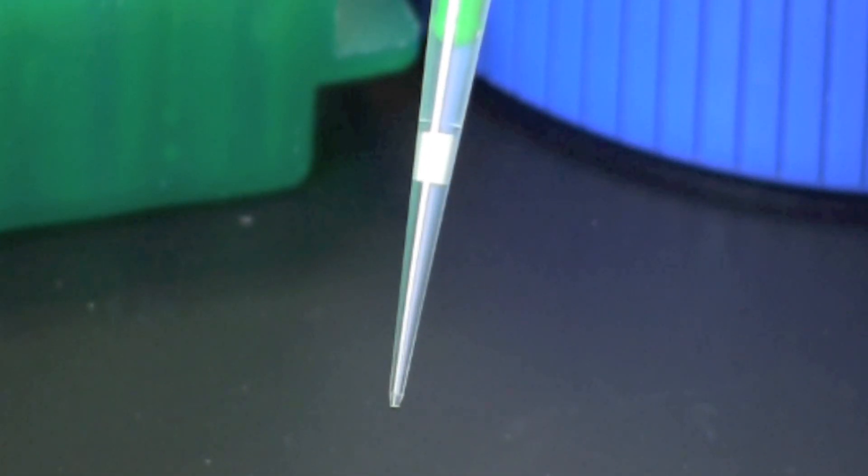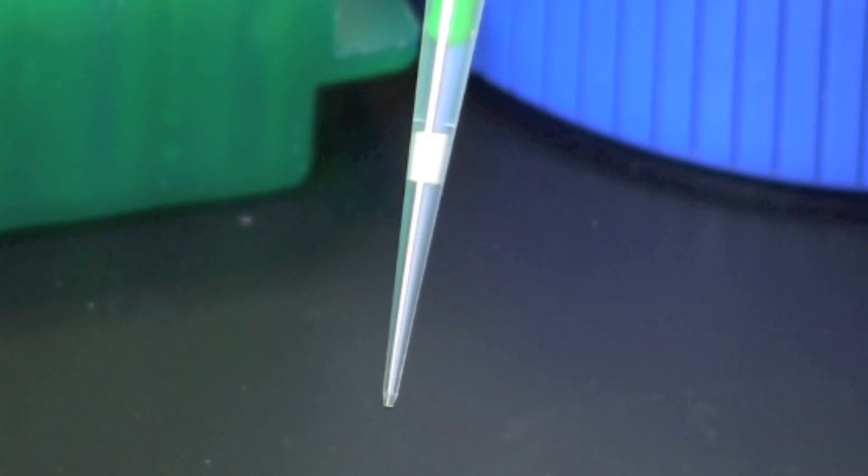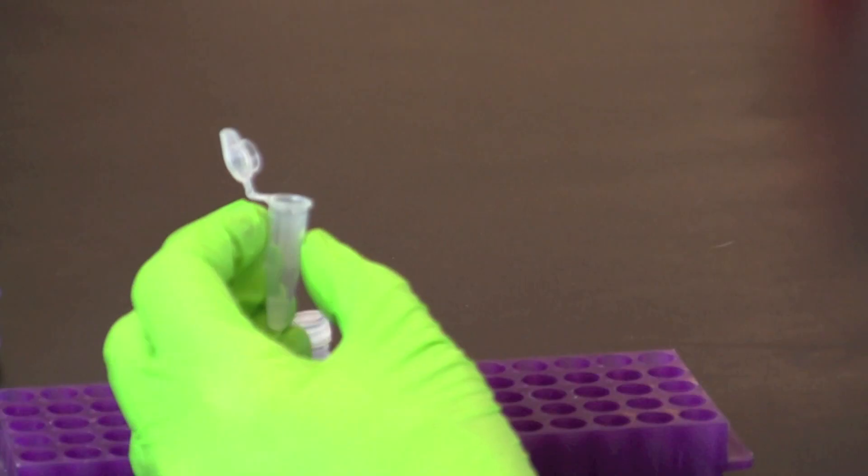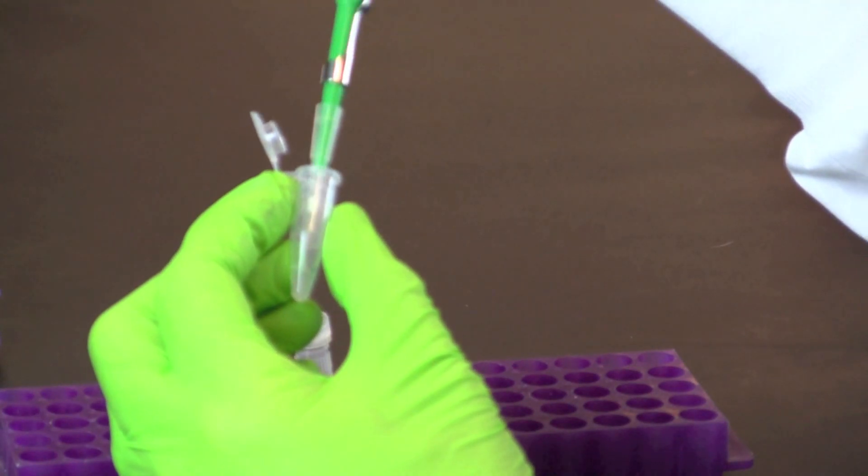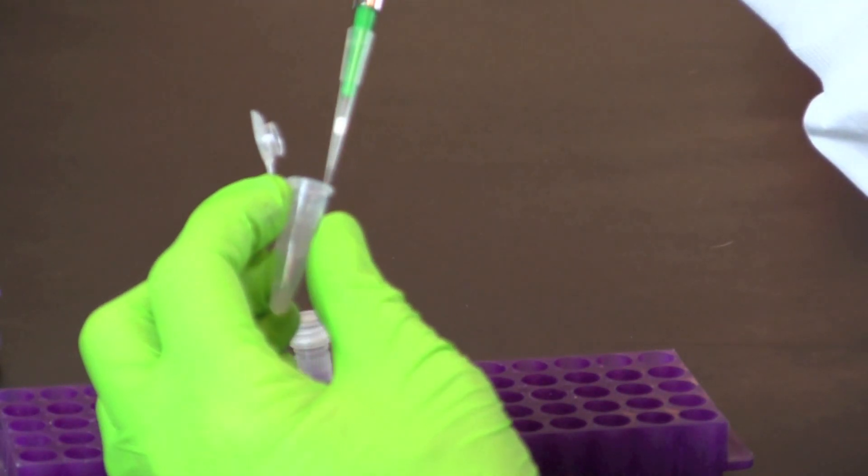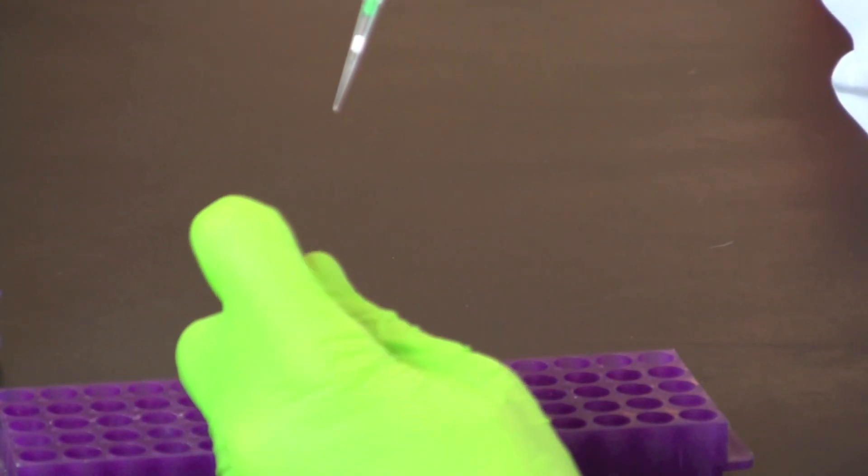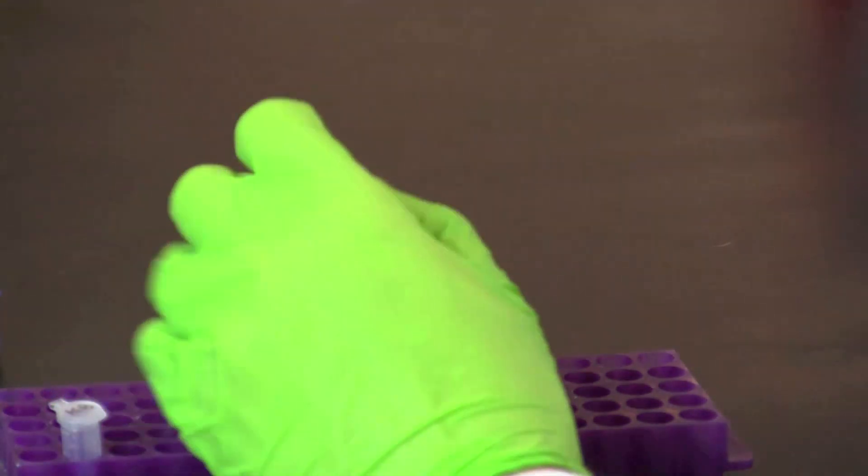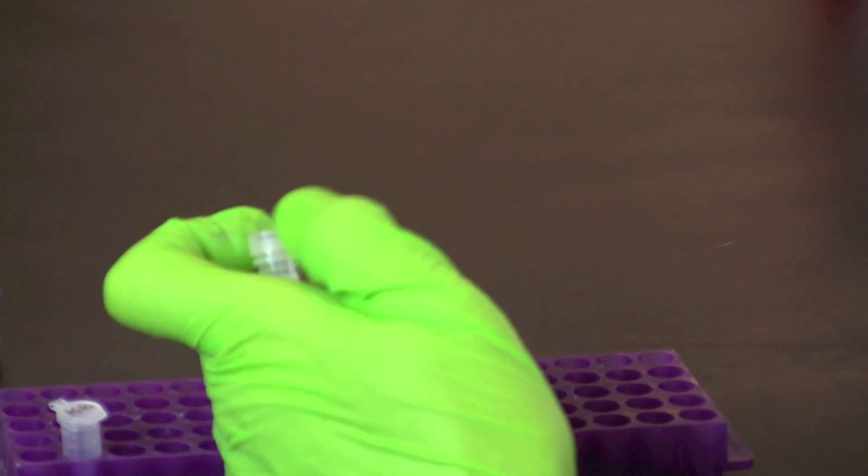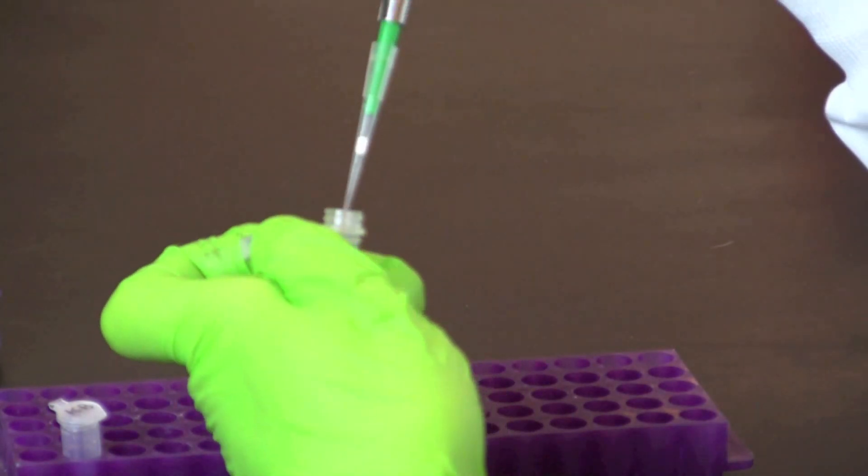Set your micropipet to 20 microliters. Always use aerosol barrier tips when setting up PCR reactions to prevent transferring aerosols from the pipette to the sample. Transfer all of the resuspended cells to a screw cap tube containing instagene matrix. This may require multiple transfers.